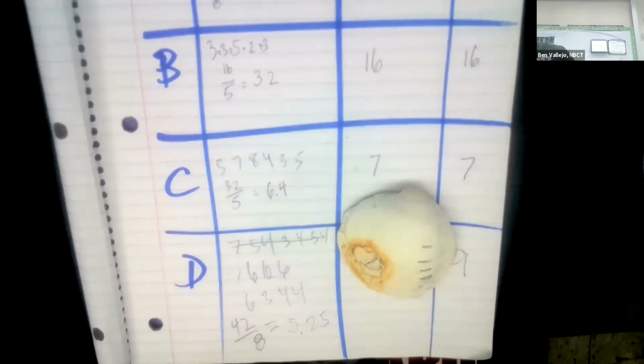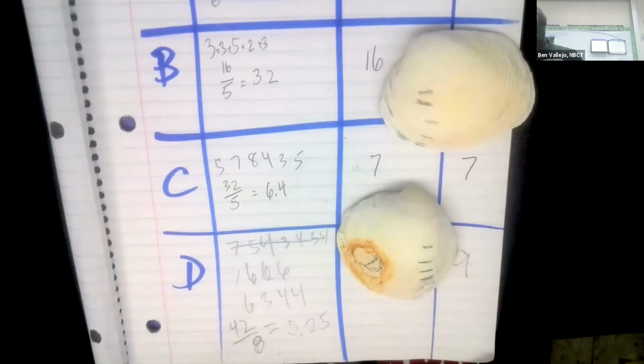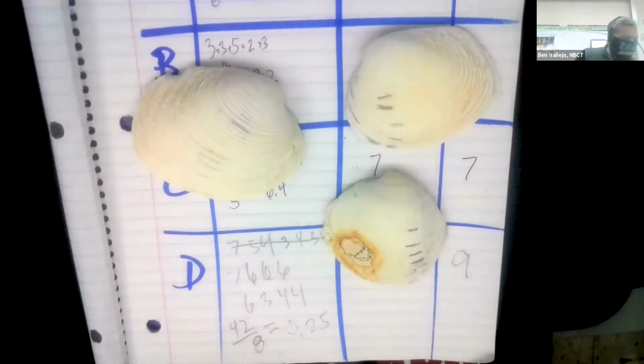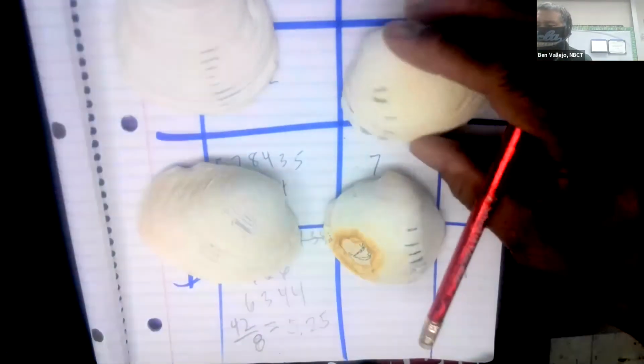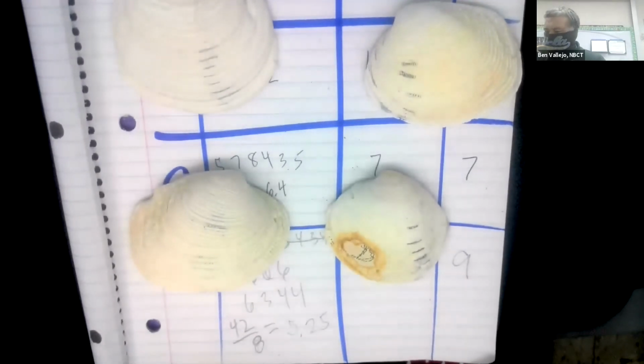Okay. And then got our other ones here. That one, this one over here. So you can see some of the differences between all those shells right there. So cool. Here's the A. So there's your A and B, C, and beyond this. I should have done this at the beginning. So we'll make that shell A.